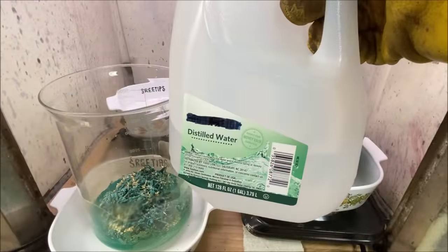I'm going to pull this off the heat. Fume production has ceased. What we're going to do is add some distilled water to cool this down and dilute it. Now what I'm going to do is pour this off into this spare beaker. There may be a few gold foils that get poured over, but most of it's settled out on the bottom.